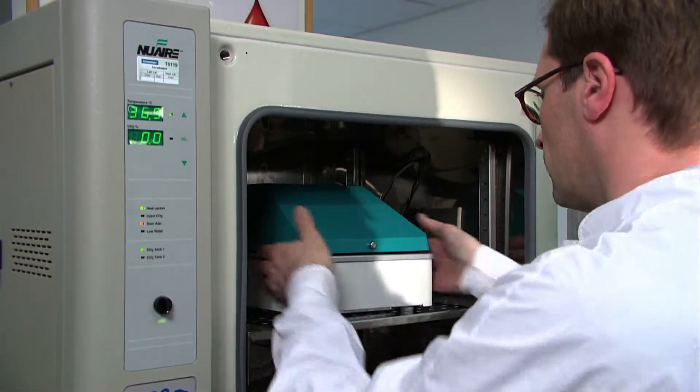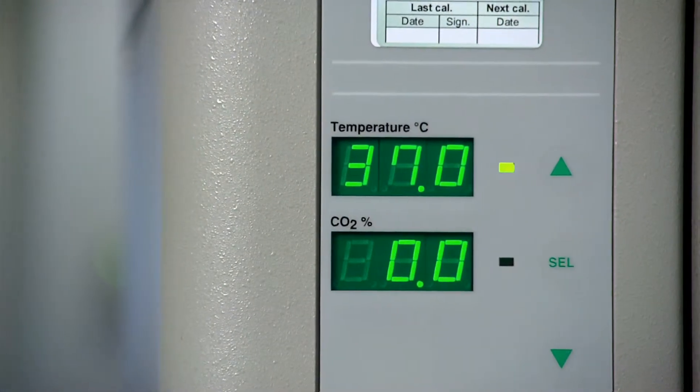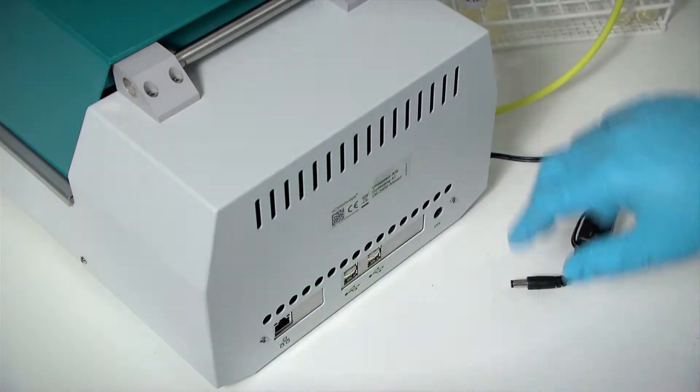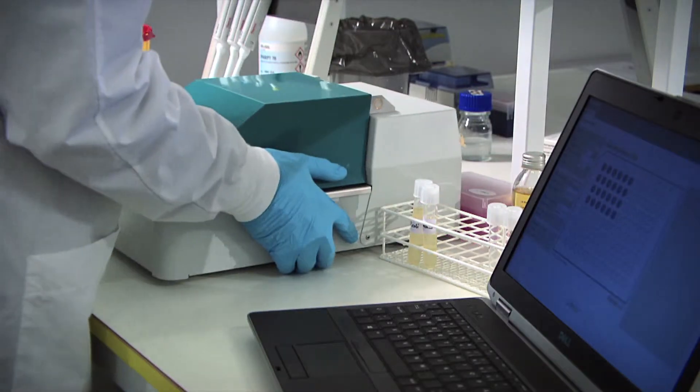Ocelloscope can be placed in a standard incubator if, for example, measurements at 37 degrees Celsius are required. This video shows how to use Ocelloscope to measure bacterial growth in a monoculture.